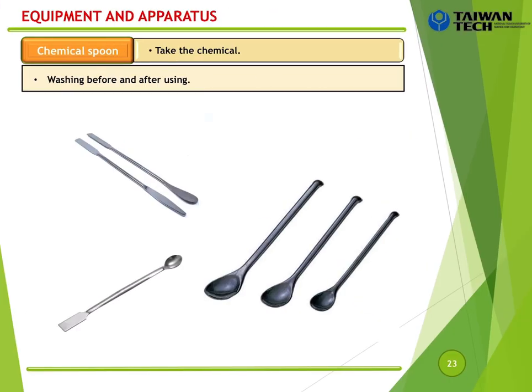Okay, and we also have the spoon in the lab, so you can see we had a stick, not chopstick, right?